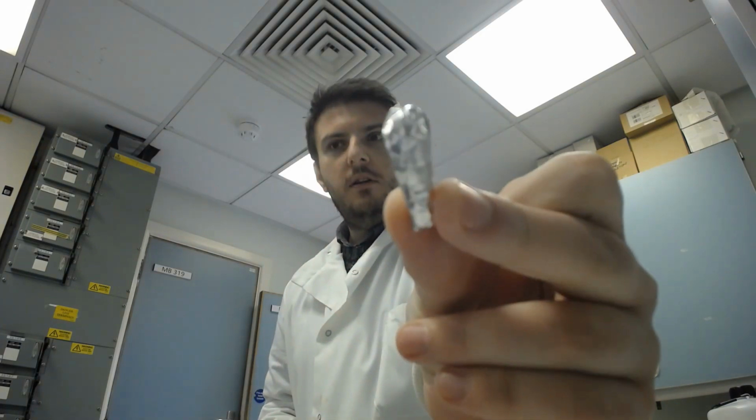So the suppositories have had roughly 10 minutes, or actually in this case a couple of hours, to set and be ready to be removed. So I'm going to show you how to do that. Then I'm going to show you how to wrap them and go through a few questions, things that you might want to think about suppositories in general, and then specifically these suppositories. And we should end up with some nicely wrapped suppositories like that. So I'm just going to re-angle the camera so you can see what I'm doing with my hands.